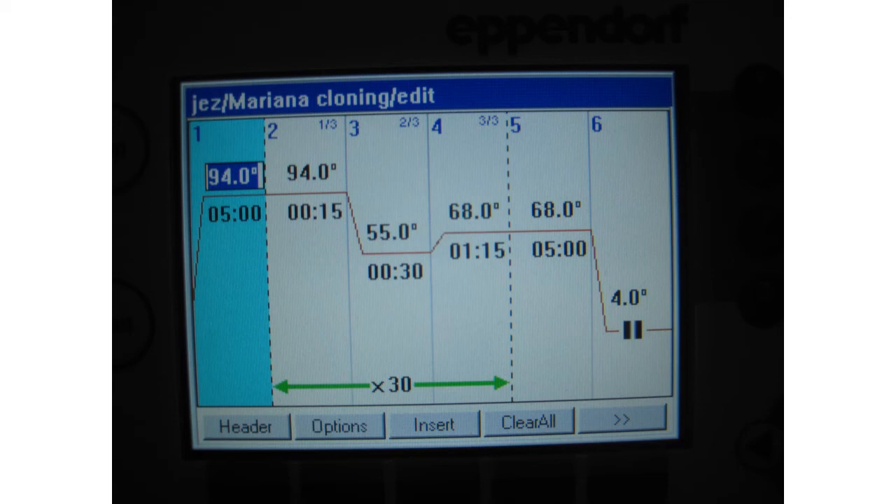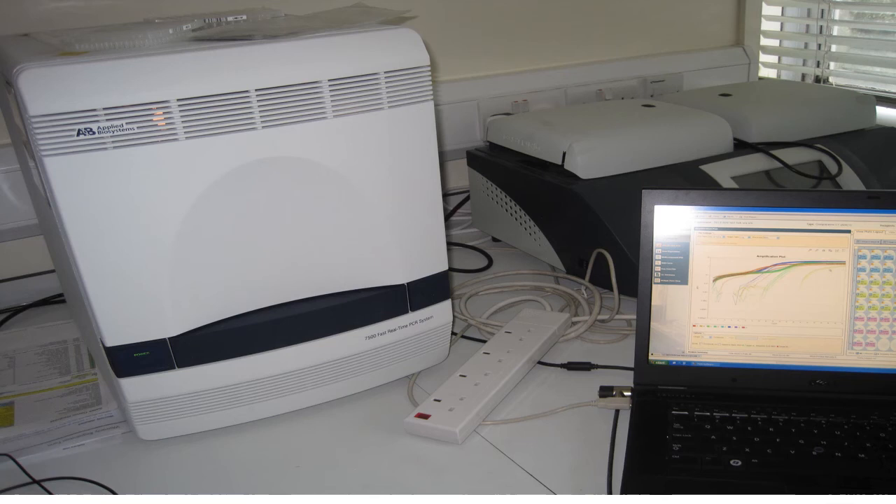In the fourth picture, Professor Simpson showed us a real-time PCR machine. The laptop quantifies the amount of copies of the specific genetic sequence being made in real-time, displaying graphs and data.